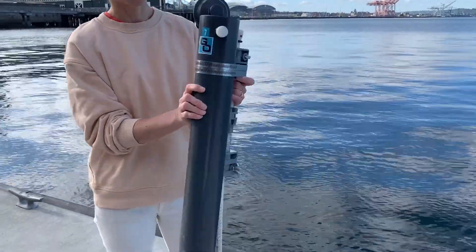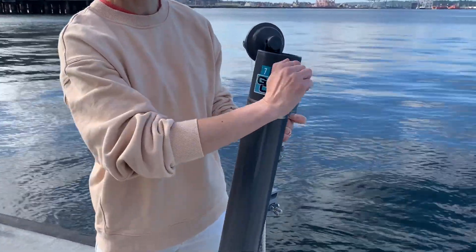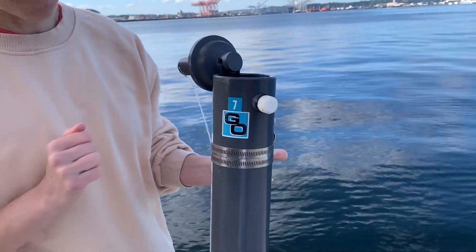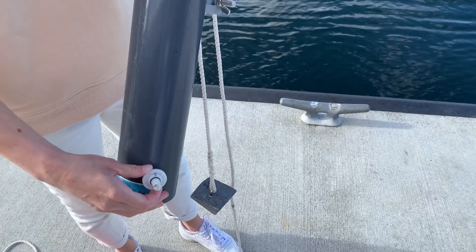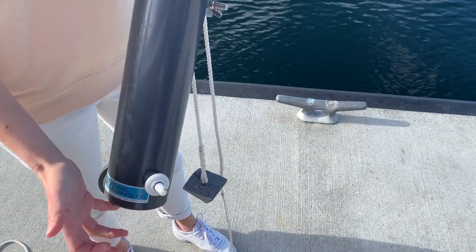So we have that weight to make sure it goes straight down. On the top here we have an air vent, and I'm going to make sure that's closed before we deploy the bottle. At this end is a drain, and we want to make sure that that is closed as well.